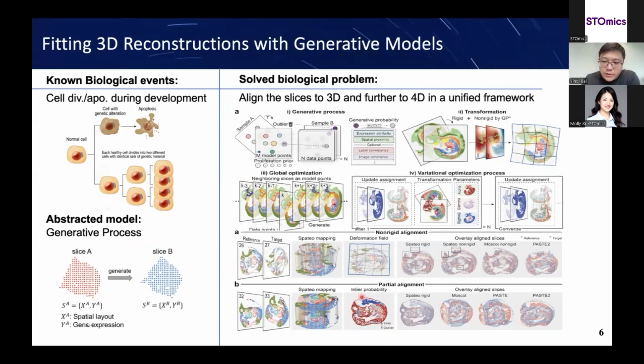And when we sequentially cut the embryo into sections, we will have the cell wall of the tube in light blue, and we also get the lumen, the hollow of the neural tube. So these two parts, although they are physically close, cannot be aligned together.